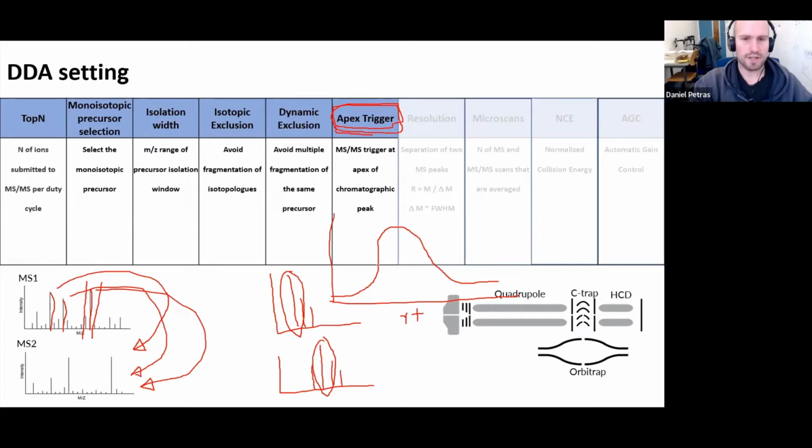Then what happens is, as soon as this peak comes up, an MS2 event is triggered and the precursor is put on the exclusion list, and then not considered again until the exclusion list expires, typically after 10 seconds. So you would get your next MS2 event after most of the compound is gone.